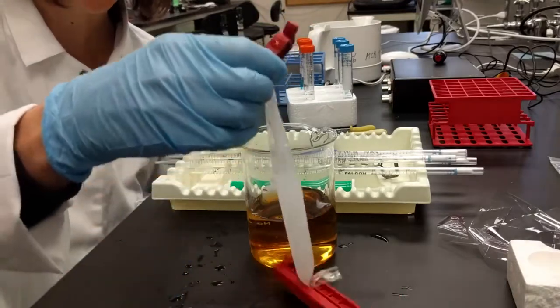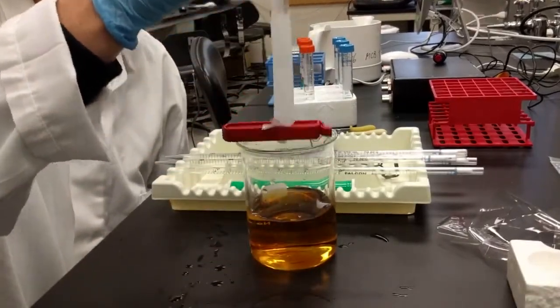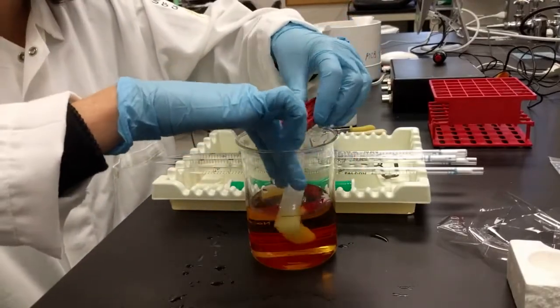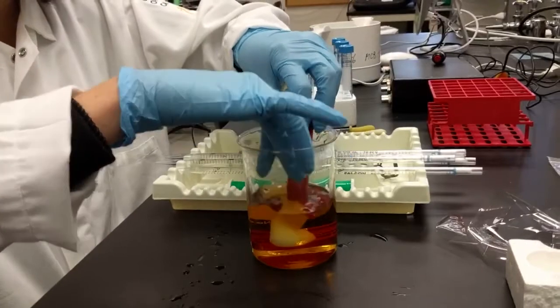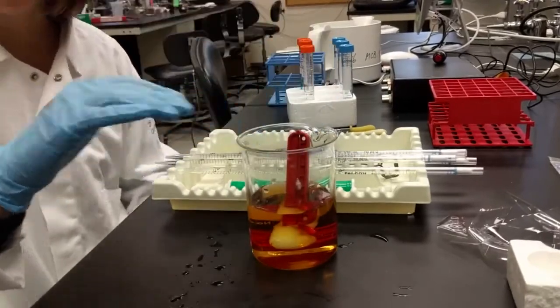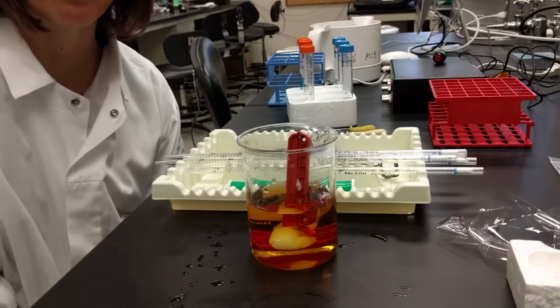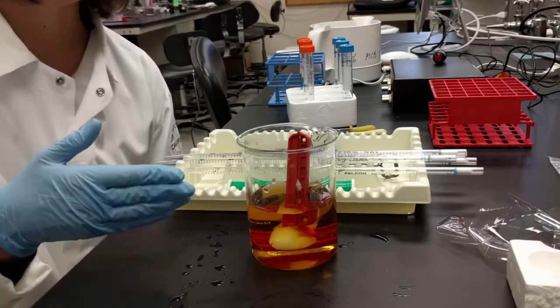And then I'm just gonna add my bag to that. Make sure it's totally submerged in there. Okay, and now we just wait 30 to 45 minutes for diffusion to take place between the bag and the beaker solution.